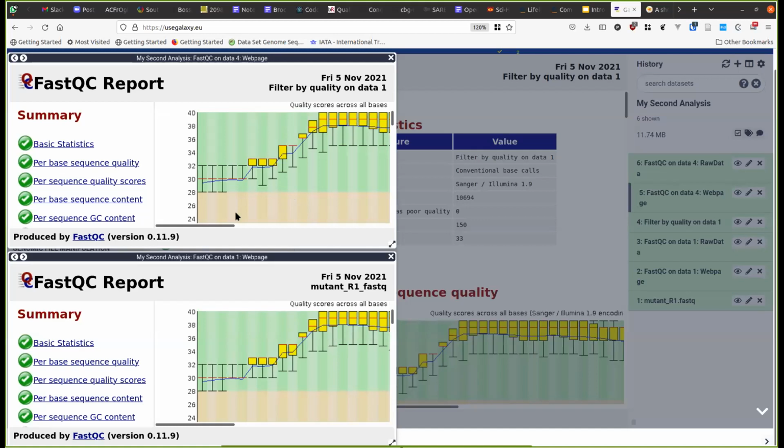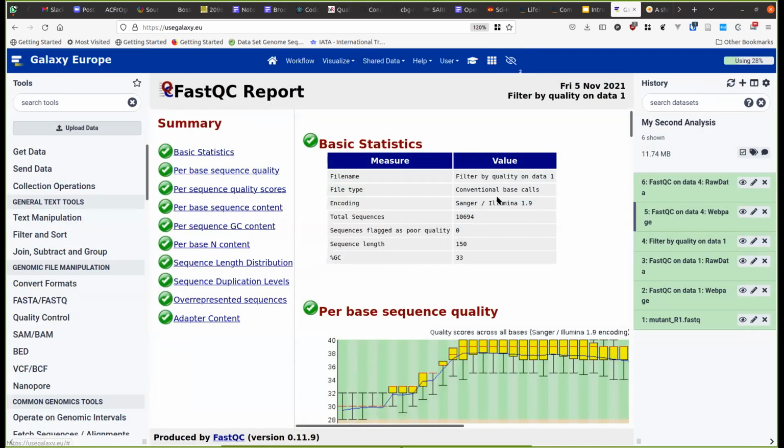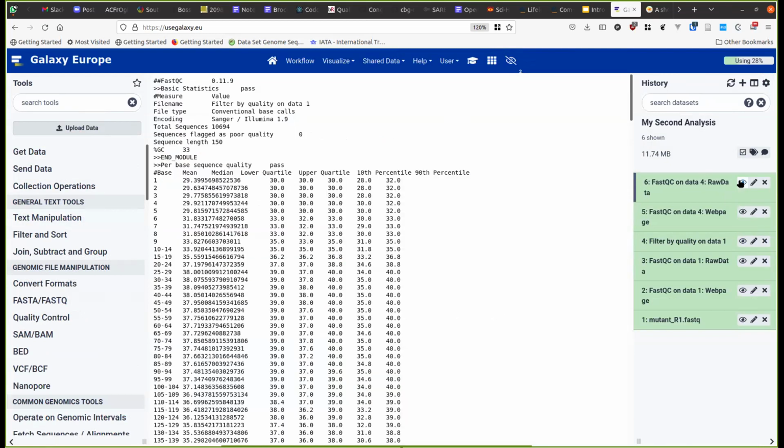Remember that we said that we're only filtering out sequences that were not 80% at quality 35 or above. So it doesn't change the start of the reads because it accepts that some reads can be a little bit below quality 35. Okay. Now that I'm finished with the scratchbook, I can click this, and now it will no longer add what I'm looking at to the scratchbook.